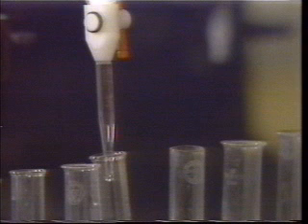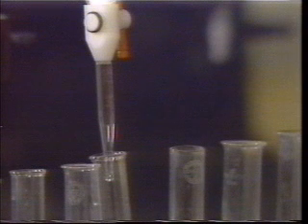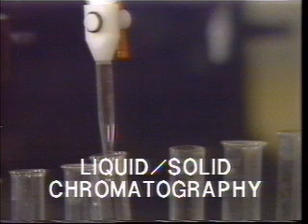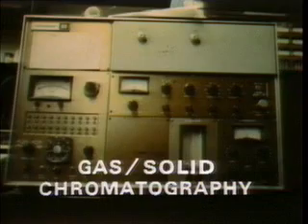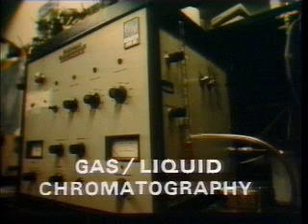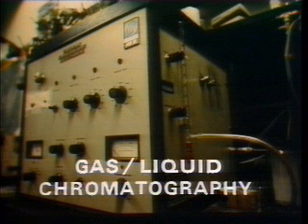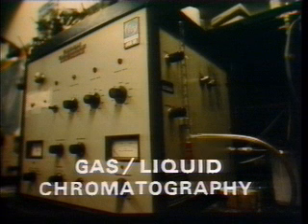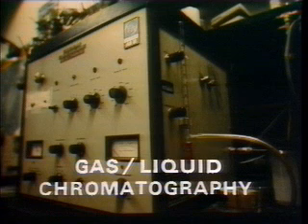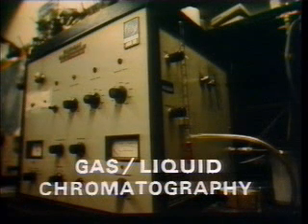Many chromatographic techniques using different combinations of phases have been developed. For instance, there is liquid-solid chromatography, liquid-liquid chromatography, gas-solid chromatography, ion exchange chromatography, and gas-liquid chromatography. Of all these chromatographic methods, the simple instrumentation and the fact that the size of the sample can be very small have caused gas-liquid chromatography to be one of the most widely used methods for separating mixtures of volatile compounds.